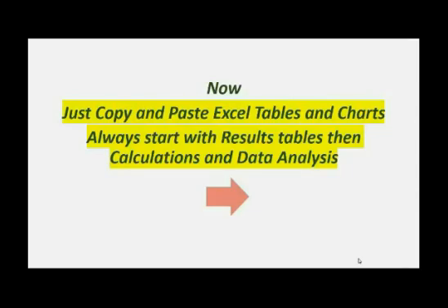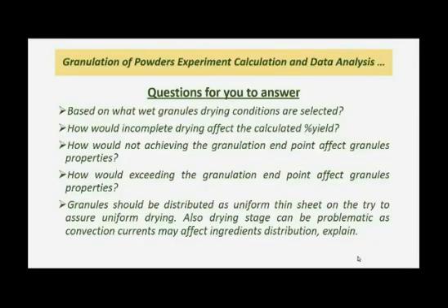Now, just copy and paste Excel tables and charts. Always start with results tables, then calculations and data analysis. Here are some questions for you to answer. Based on what are wet granules drying conditions selected? How would incomplete drying affect the calculated percent yield?